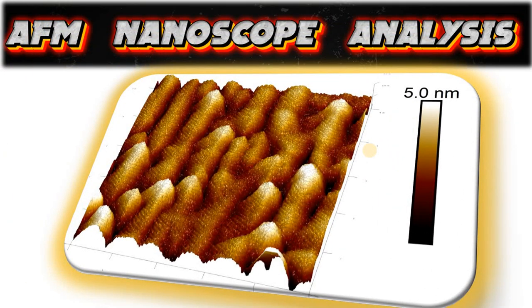The software also supports advanced techniques such as force spectroscopy and phase imaging. These features make it essential for detailed surface analysis and material characterization in the fields of nanotechnology, material science, and biology.